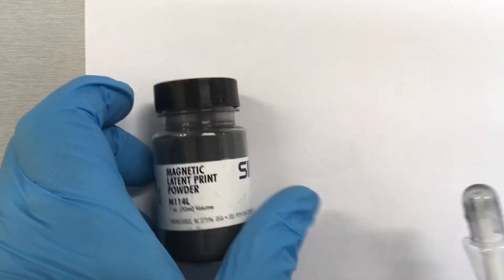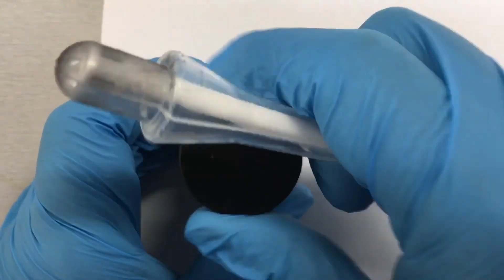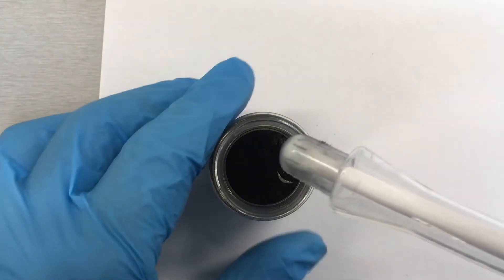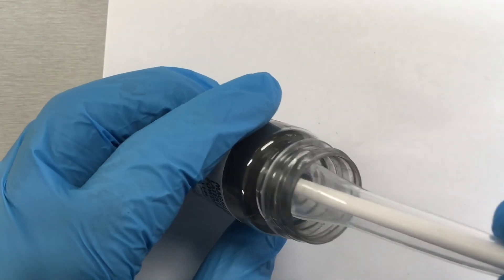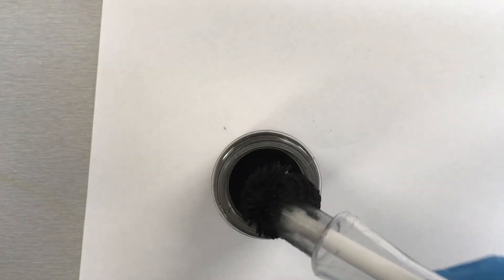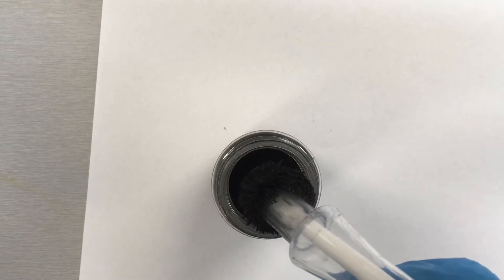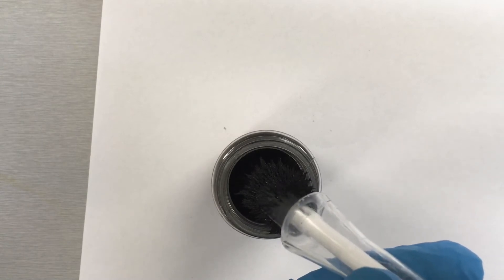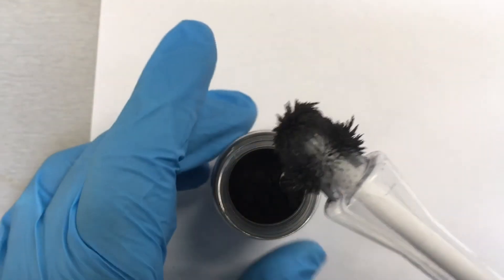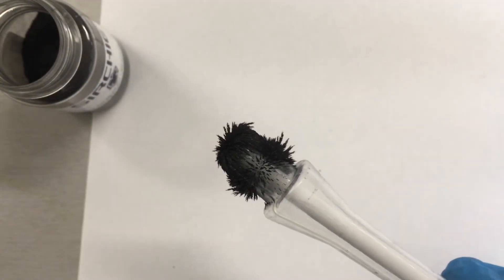I'm going to open this up and show you how to extract the powder. With the magnet inside, dab it in there and then we acquire all of that powder. The best thing to do is to try and reduce that powder just a little bit — you don't want too much of it. Then it's ready to apply to our slide.